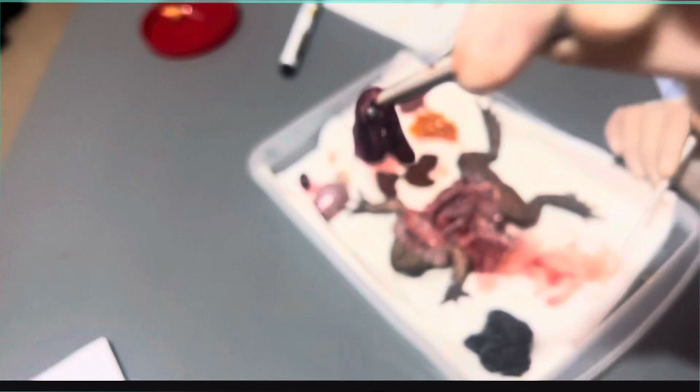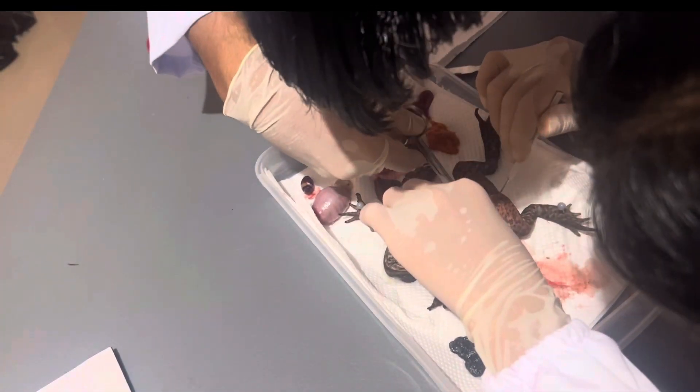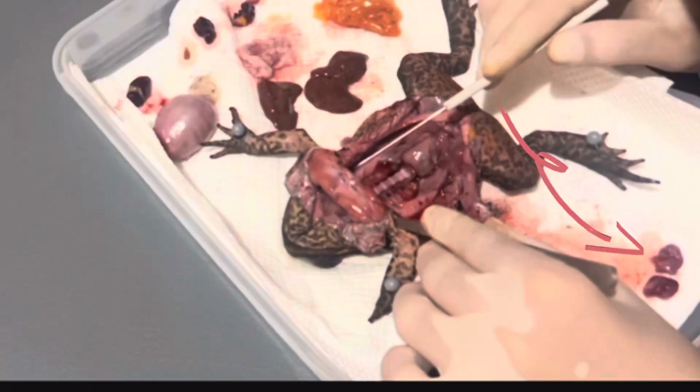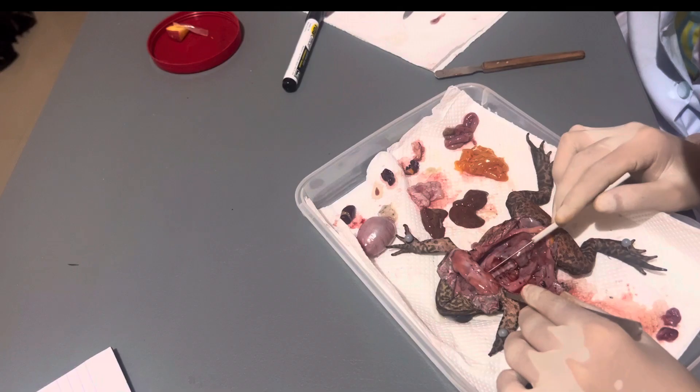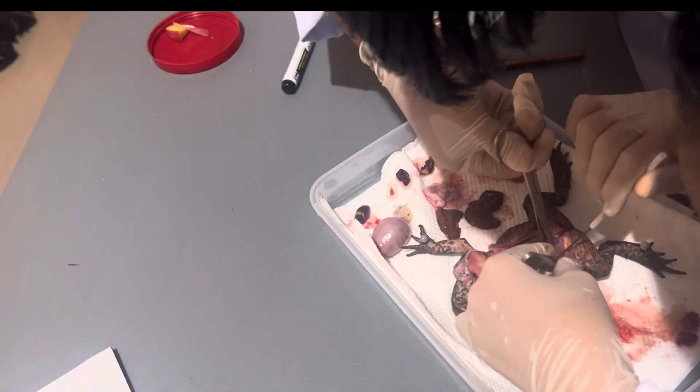This is the kidney. The kidney of the toad is not bean-shaped unlike the kidney of a human. The function of this is to remove nitrogenous waste or urine from the blood. And the lungs — the lungs of a toad are very small compared to the lungs of a human, because our lungs take up almost half of our abdomen. The lungs bring oxygen from the air to the blood and remove carbon dioxide from the blood.